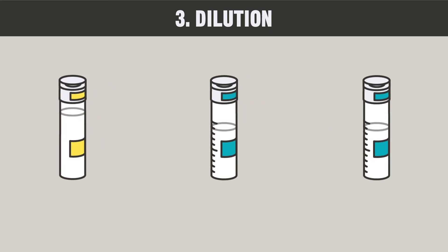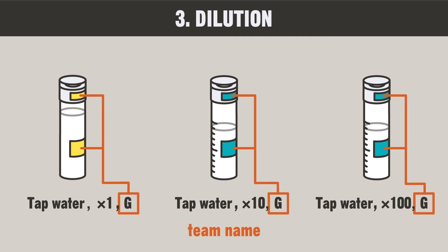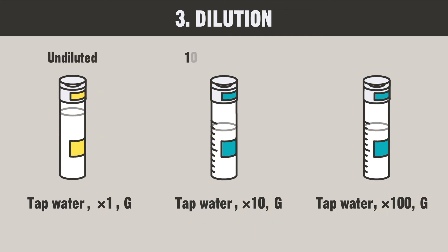Before diluting the sample, write down the names of the sample, the dilution factors, and the names of the teams on the bottles with the undiluted, 10-fold diluted, and 100-fold diluted samples.